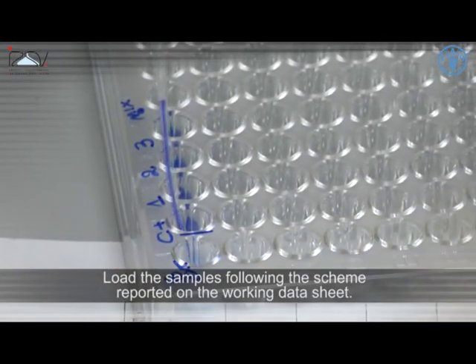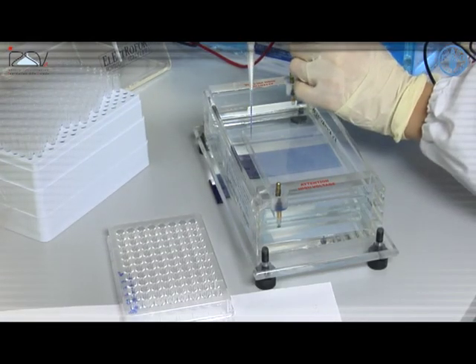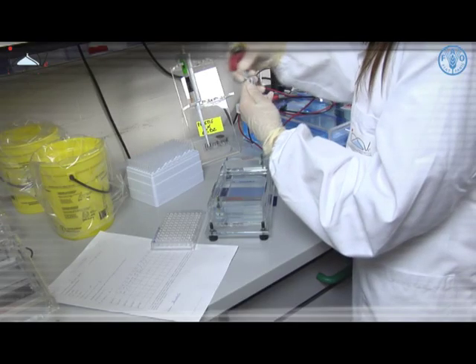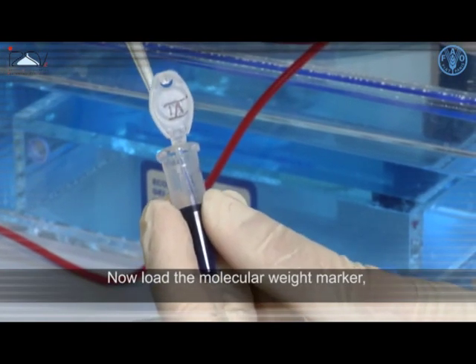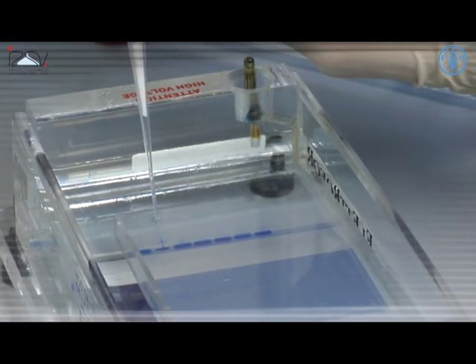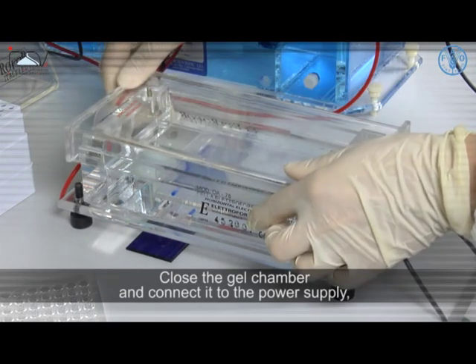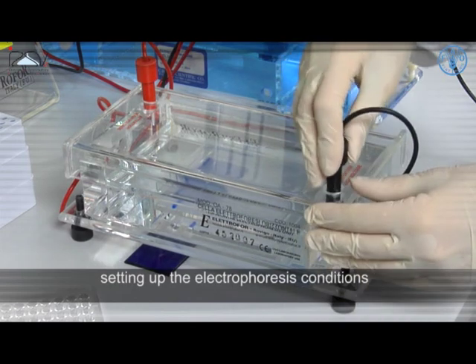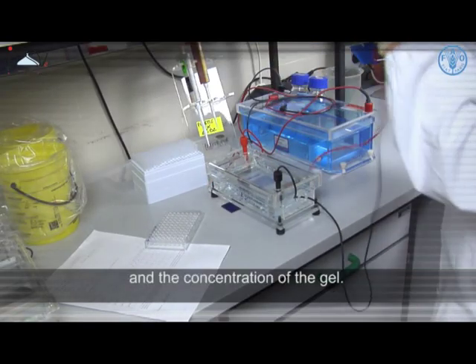Load the samples following the scheme reported on the working data sheet. Now load the molecular weight marker chosen on the basis of the expected molecular weight of the amplicon. Close the gel chamber and connect it to the power supply, setting up the electrophoresis conditions according to the length of the target fragment and the concentration of the gel.